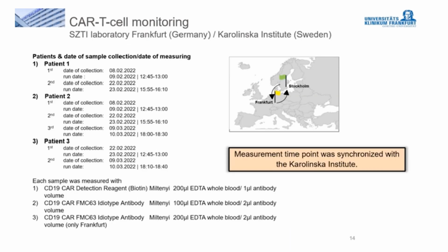Now I will move on to the second part of the presentation. For stem cells, T cells and many other immune cells in Germany and Austria, INSTAND offered a wide range of external quality controls, so-called EQAs, in the area of hematology and immunology.